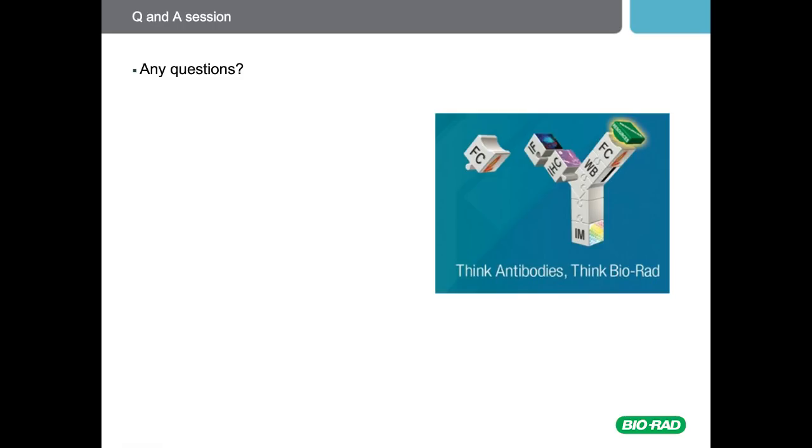Okay, so my first question is, how fast should I spin my cells when washing? When you're centrifuging your cells, you're trying to find a balance between forming a nice firm pellet but preventing loss of viability. You'll find that spinning between 300 and 400 Gs will usually be best for this. You'll have a pellet which isn't too loose so it doesn't fall out when you decant, but also you should maintain the maximum viability.